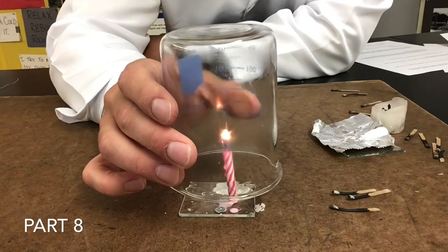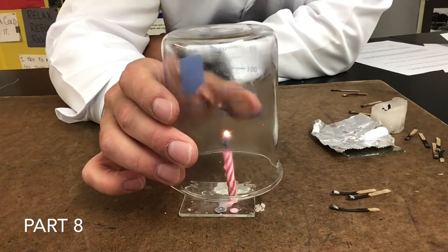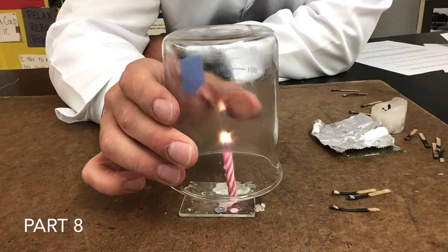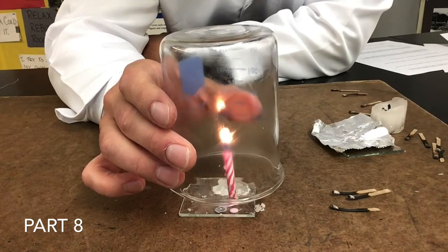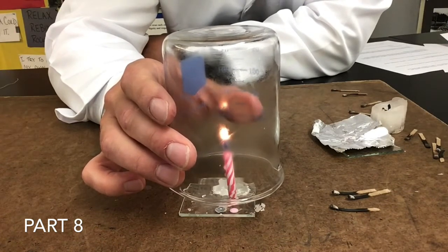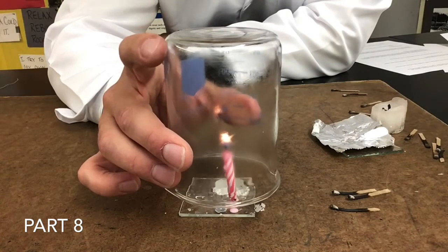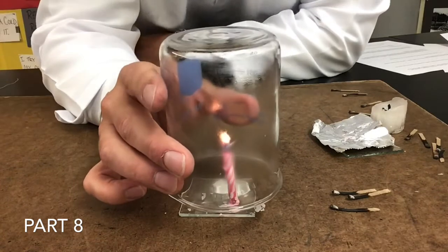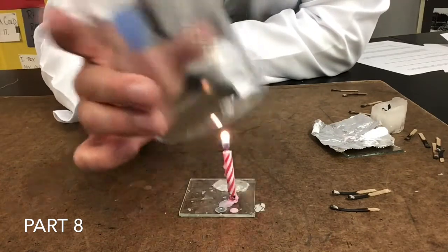So that flame is flickering. It's not completely going out. But if you notice, the beaker is starting to get foggy. So there must be some kind of gas that's being given off by the candle, and then that gas is hitting the cold beaker. And it looks like it's almost turning back to a liquid because that's what a fog is on a glass. It's like condensation.